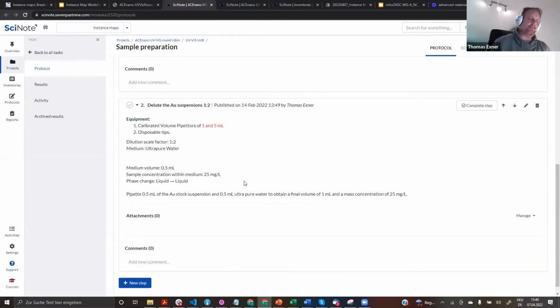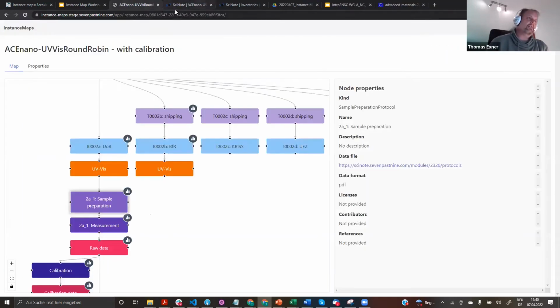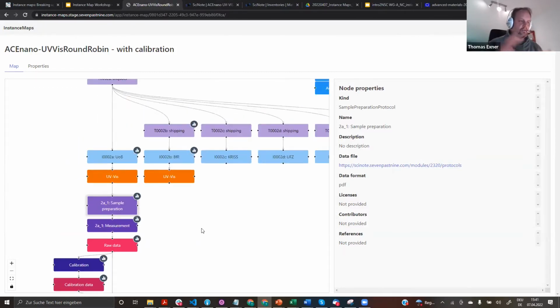These ones are more interesting because here we now describe how the data was actually, or the sample was created, and then what the measurement was actually done, how it was done. But again, also here we try to keep it as small as possible. Each of these parts of the experiment, we really try to break them down into these logical units, because then first the data documentation can already be done.